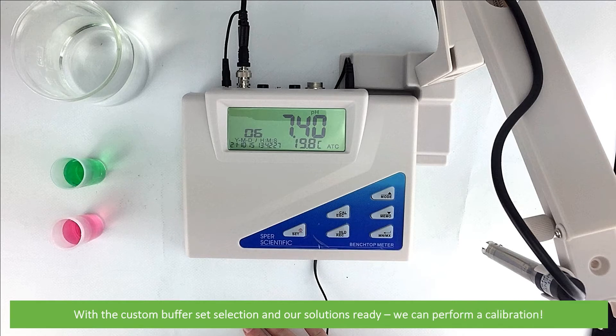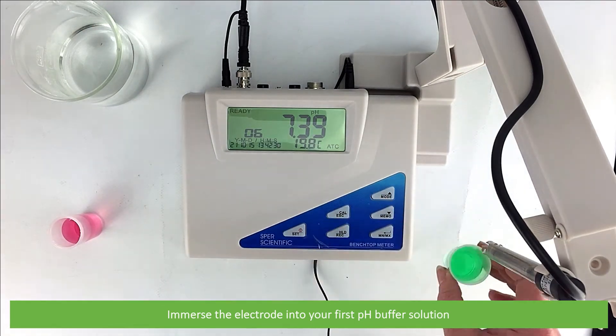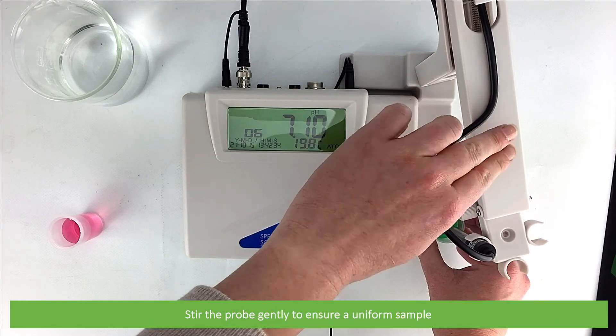With the custom buffer set selection and our solutions ready, we can now perform a calibration. Immerse the electrode into your first pH buffer solution, stirring the probe gently to ensure a uniform sample.